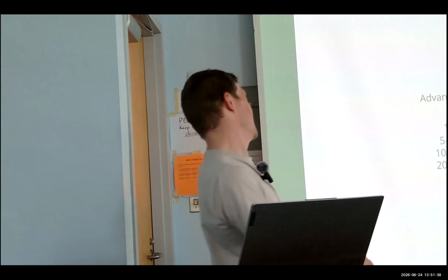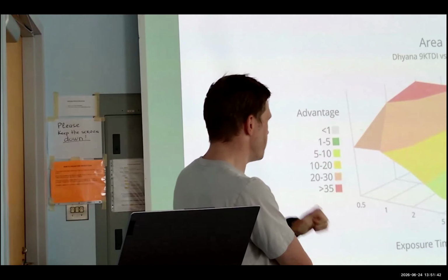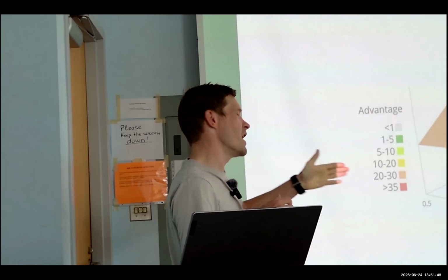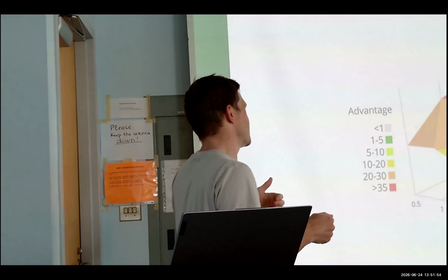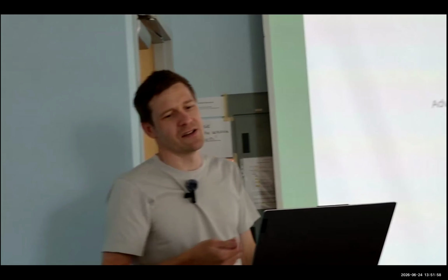Where it makes sense to use line scan, it is super fast, but there's a trade-off as your exposure time gets longer and your magnification gets higher. It basically becomes a bit less of an advantage.